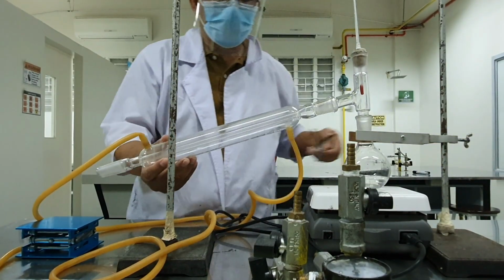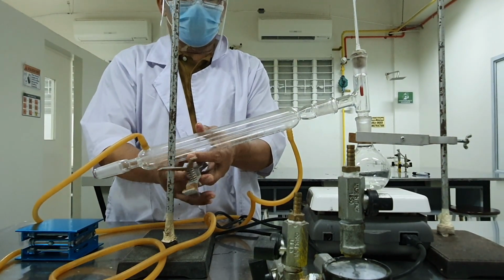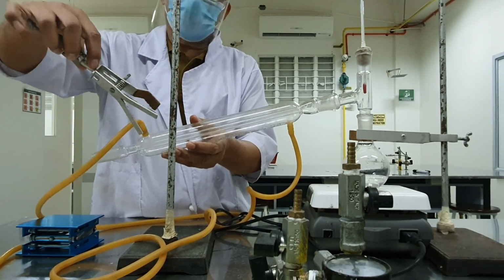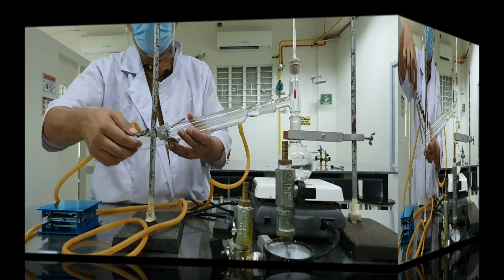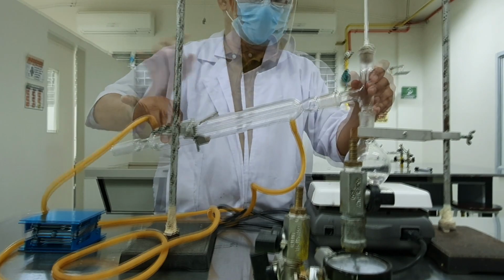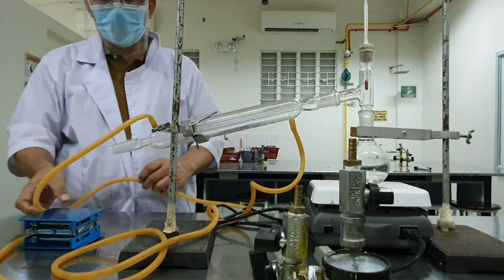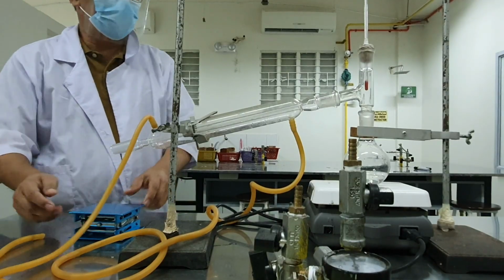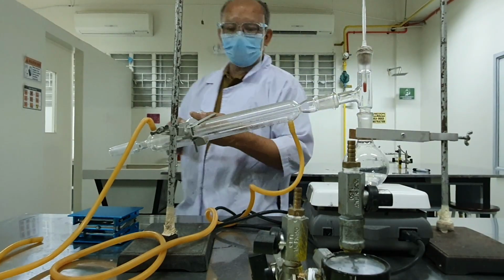We're going to support this. I think that's okay now, and then we're going to place our receiver here. Then place our adapter.